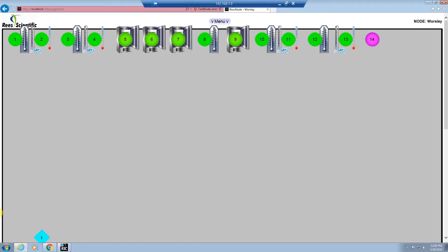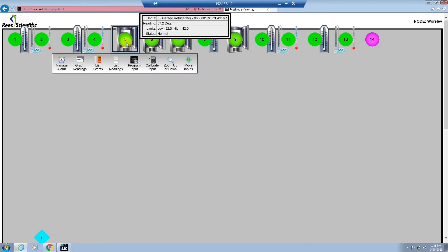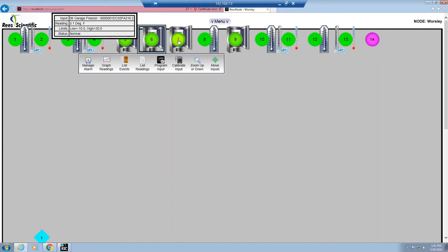After successfully logging on to the system you will see your inputs displayed on the screen. I will now cover how to obtain information from an input. To do this you simply need to left-click on an input. A menu will appear that will display the input's name, the current reading, the low and high limit, and its current status. You can do this for any one of the inputs on your screen.